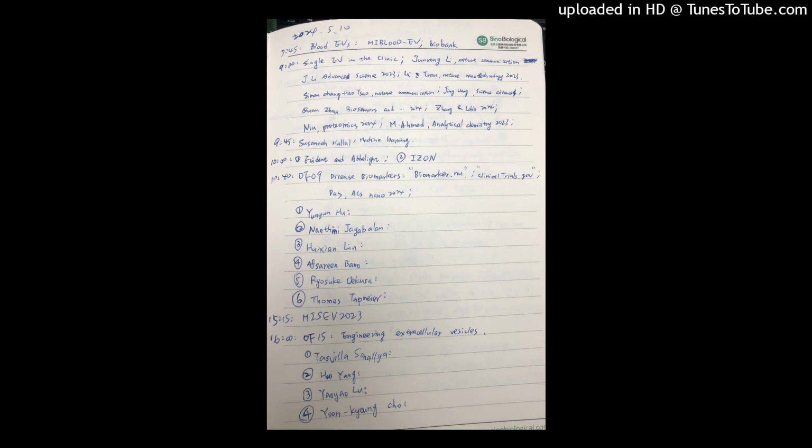And the other thing is that when I look at proteomics, I use EV isolation as a so-called cleanup process because it removes the albumin that needs to be removed. If you work with saliva, you need to remove the amylase. In urine, you need to remove the protein that is there. All these things need to be addressed within EV work. It would be nice to bring some of these approaches in.